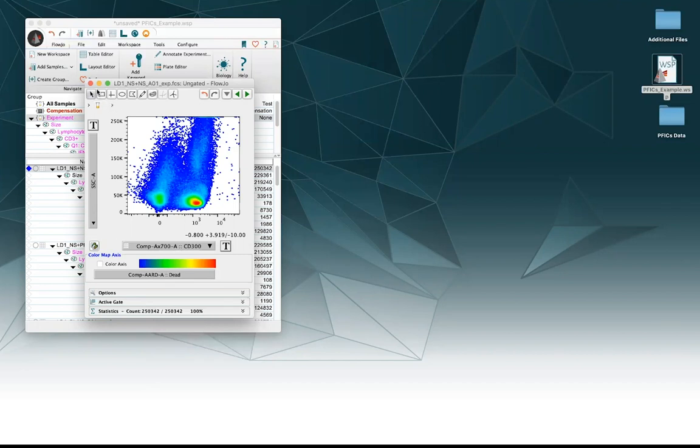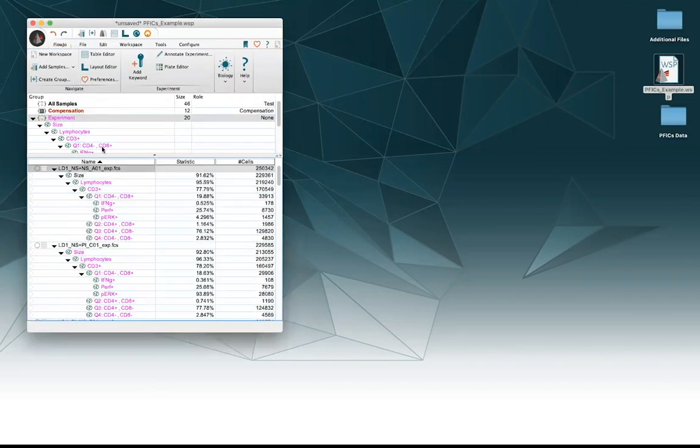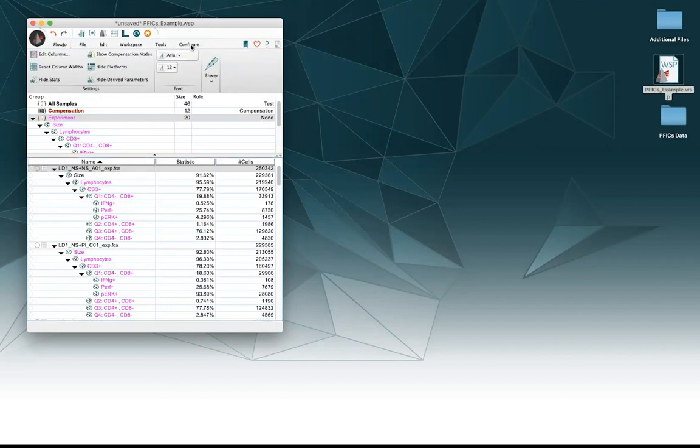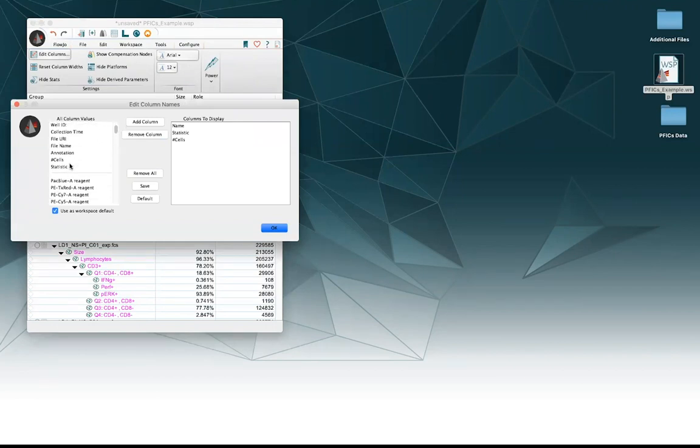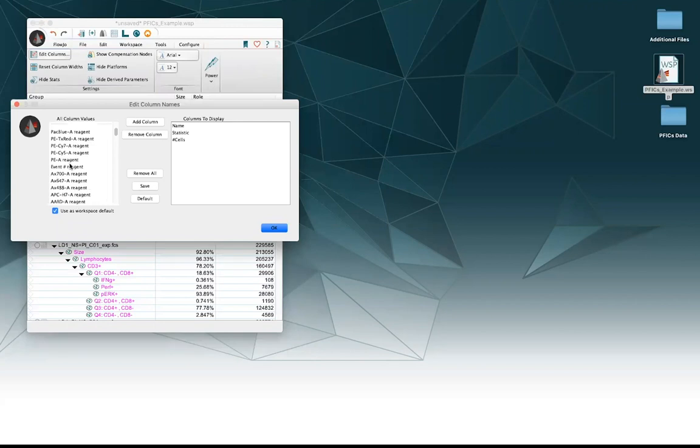Well, I can change that here in FlowJo and make it look right in my final analysis. So the way we do that, we go up here to the tabs and go to the configure tab. Then we go over to edit columns. There's a lot of options for columns in this left hand side here, but luckily there's a whole little section for those different stains.